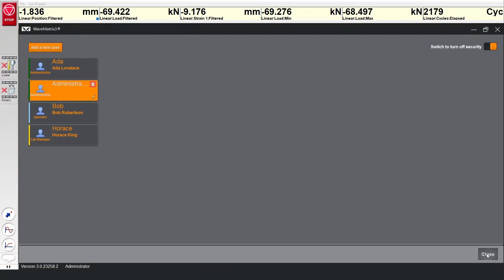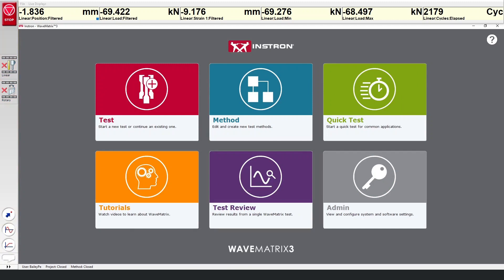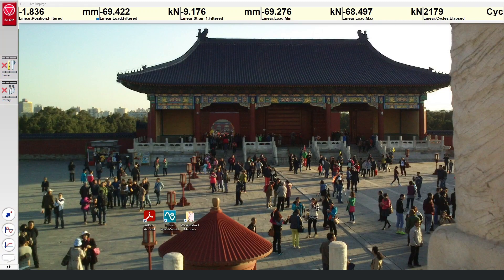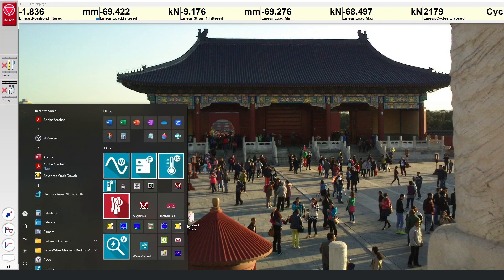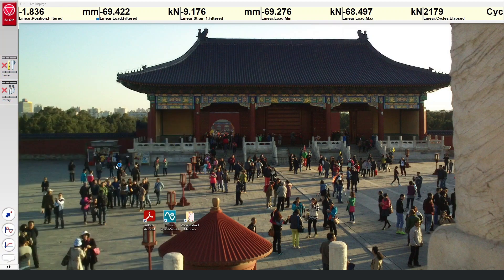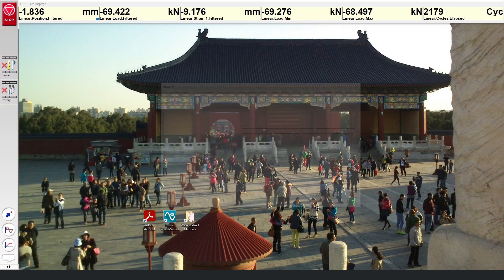With security enabled and user profiles set up, you can close this and return to the main Wavematrix window. Wavematrix needs to be restarted for the security features to come into force.